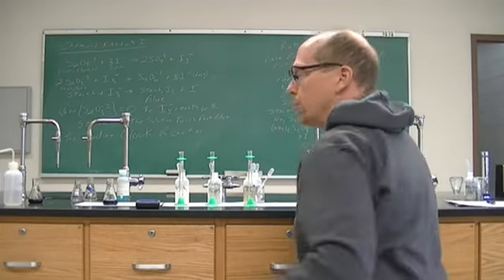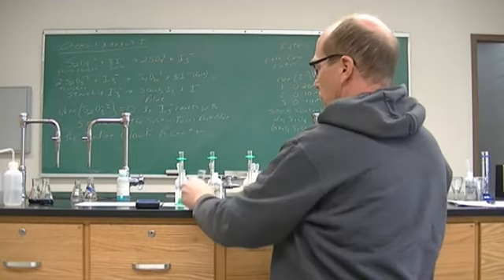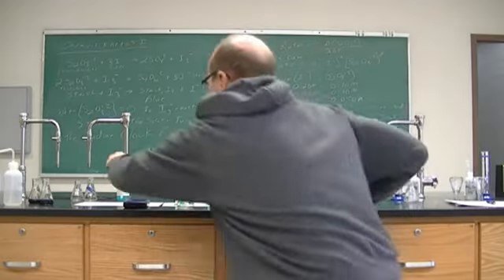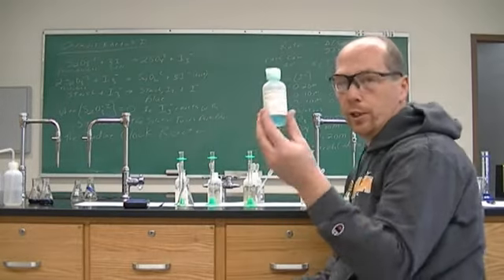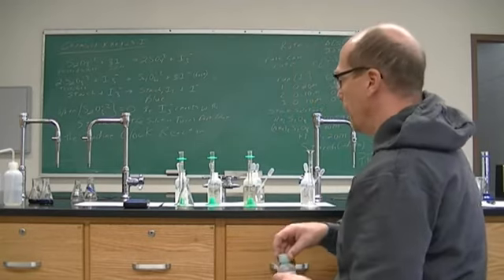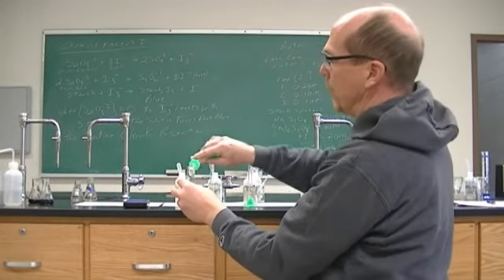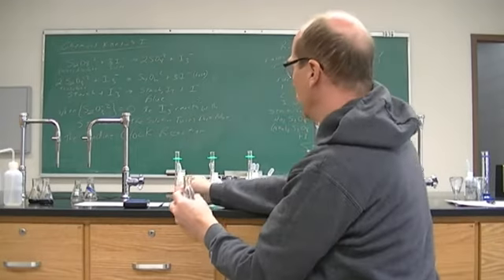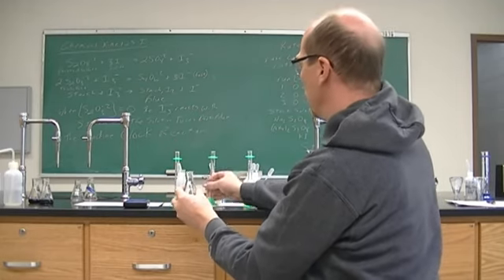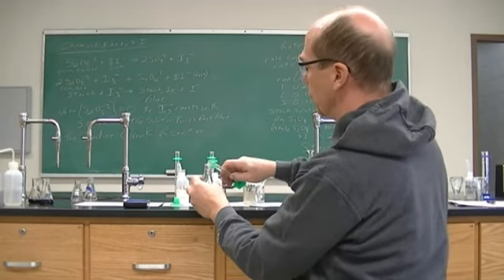All right, so now we're going to do the effects of a catalyst. So have another, set this. Okay, for the catalyst, we're going to use a copper nitrate catalyst. A catalyst works by lowering the energy of activation and makes the reaction go much faster. So we are going to put in our same things: 3 mils of starch, 5 mils of the S2O3. Now we're going to do the same as the first 3 runs, so I'm back to my 0.2 molar KI, so run 1 was 0.2 molar KI.